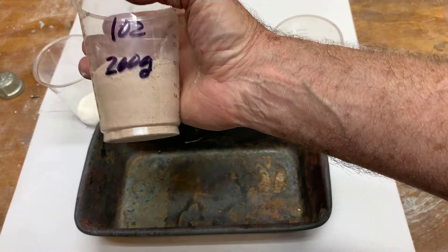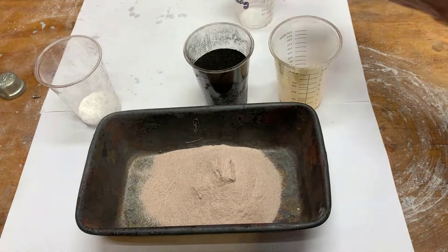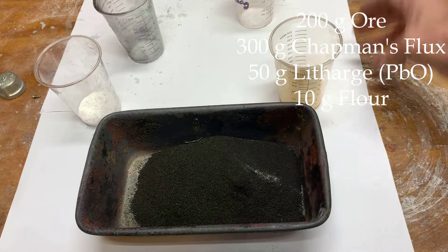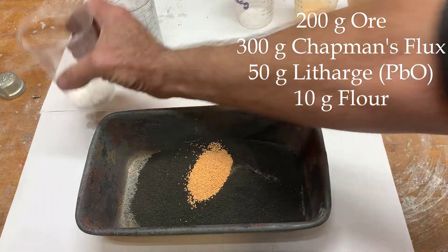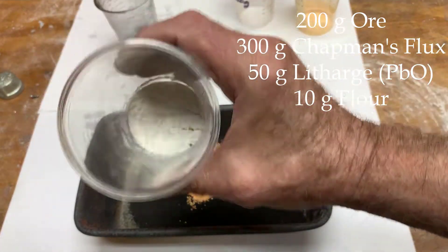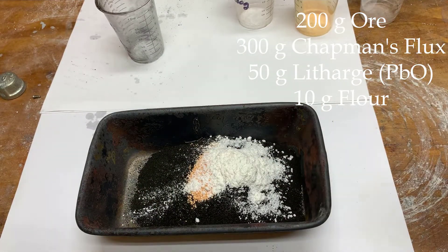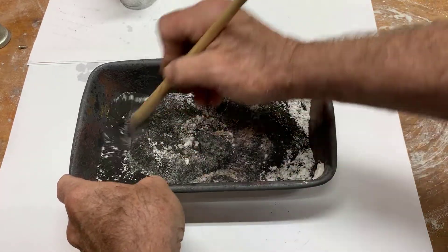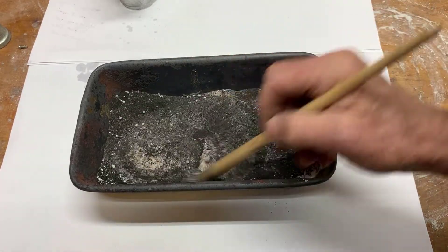Here's the mixture for smelting. This is sample number 102: 200 grams of ore, 300 grams of Chapman's Flux, 50 grams of Litharge, and 10 grams of Flour as a reducing agent. We'll see if that's enough — I've had some trouble getting the smelt to reduce to lead. I'll stir that up. This is a good-sized charge for an A6 Fireclay Crucible.